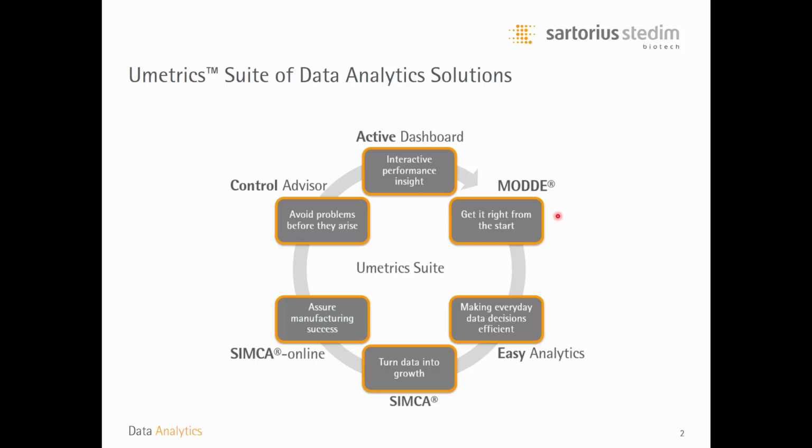Today we're going to look into one of the new additions in the MODDE 12 software, which is called Generalized Subset Design. MODDE is our design of experiment software, and you can also carry out quality by design, robust optimization, and design space estimation using this software.